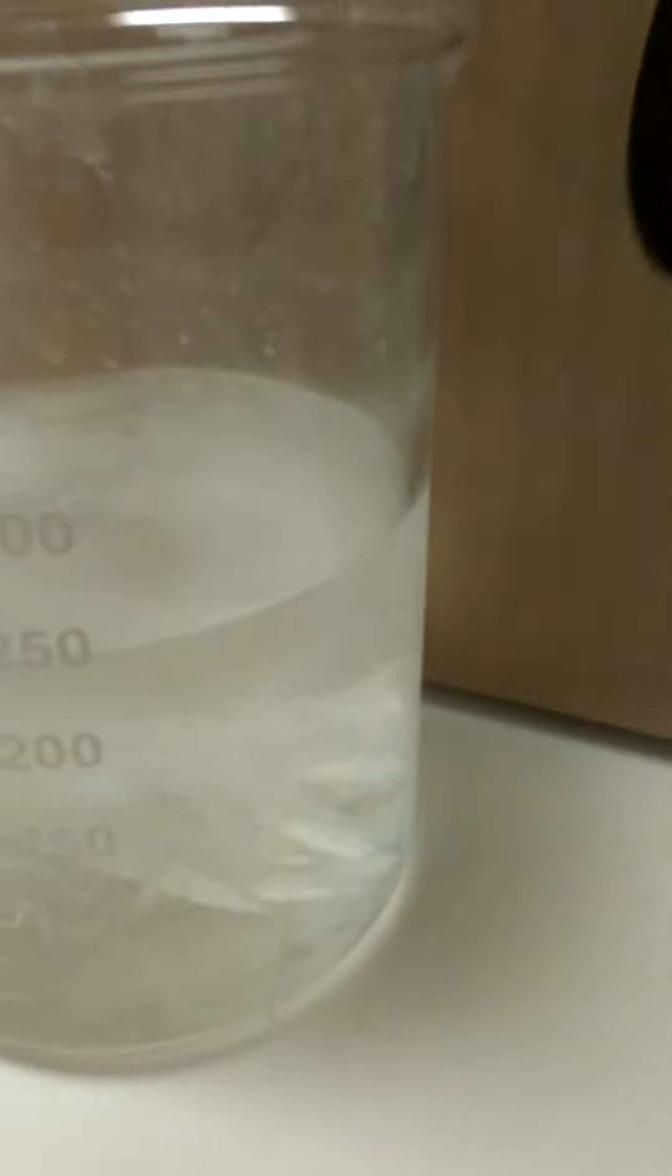Here is the salt water. You can see the crystals at the bottom.